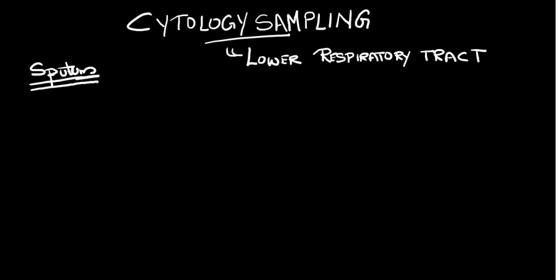And for sputum sampling, when you examine it in the microscope, we have to always look for adequacy, that is, to see for alveolar macrophages. Now, as already told, the sample has to come from deep within the respiratory tract, from the alveolus.